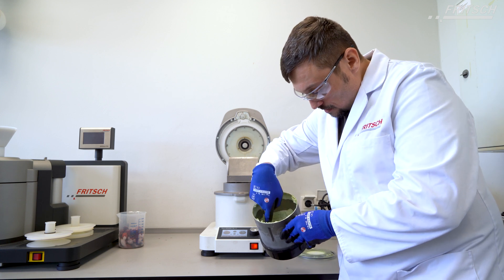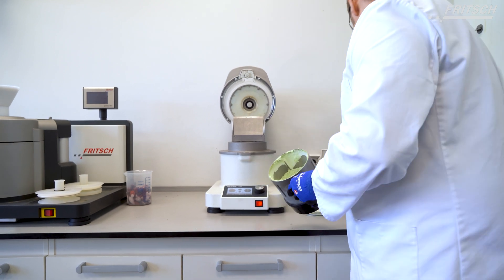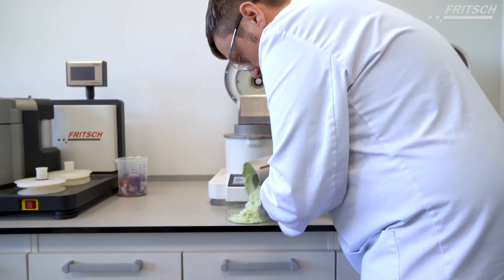As you can see, a greater quantity of sample inside will result in more coarse pieces.